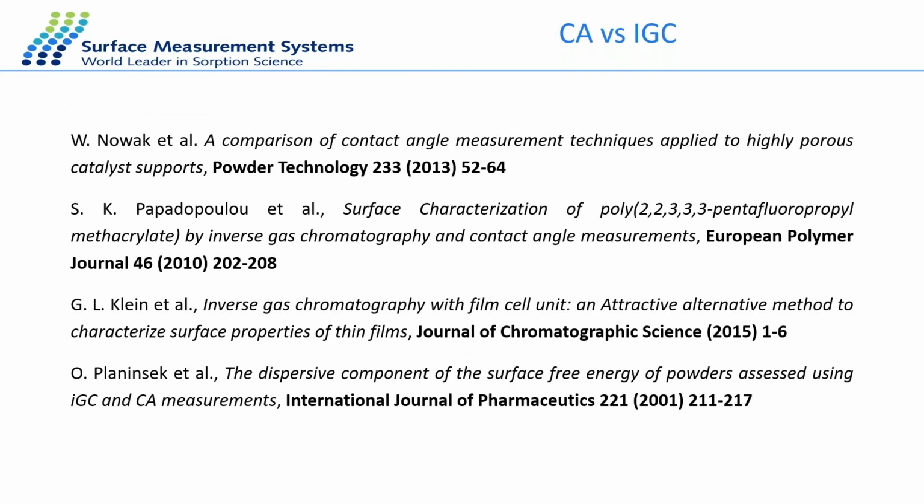There are other publications as well which discuss the differences between contact angle and IGC. And it was found that IGC is more accurate on porous materials and powders than contact angle.